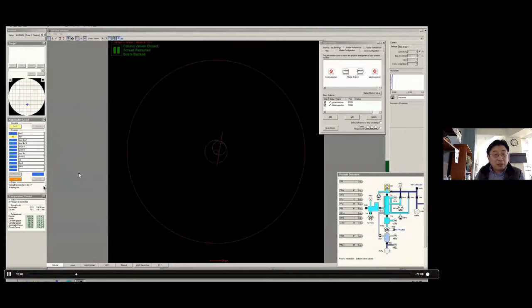And back to the first question Jed asked, I think the key thing is we skip a lot of focus steps and also skip a lot of tracking steps. By skipping these two, we speed up the processing. But you do need to make sure that the microscope stage is well behaved. So that basically means you need a good calibration, including focus and other calibration. So that's actually one of the main reasons for the speedup.